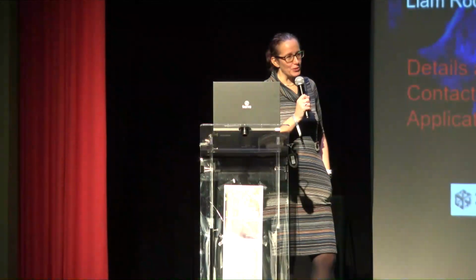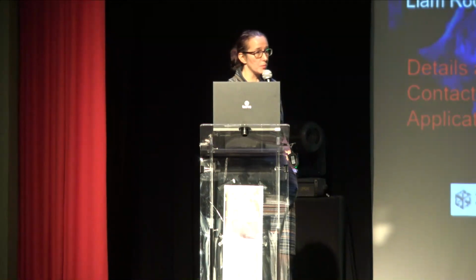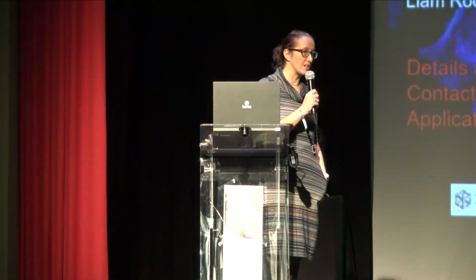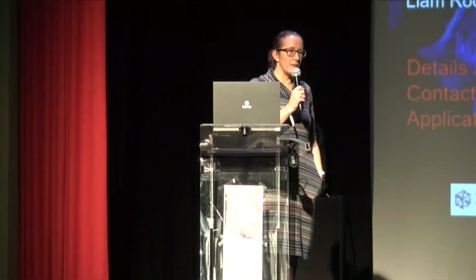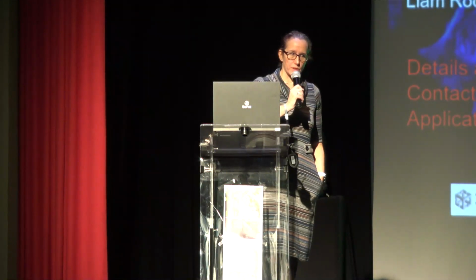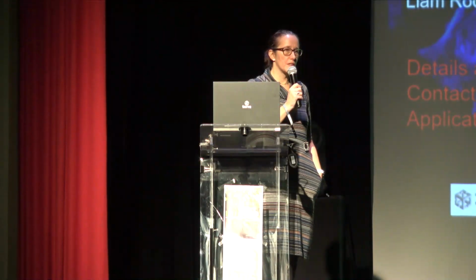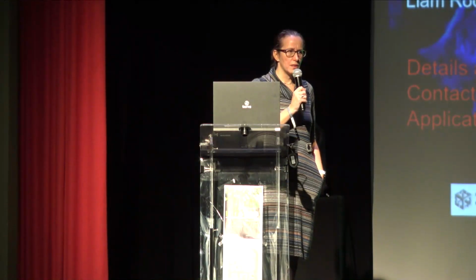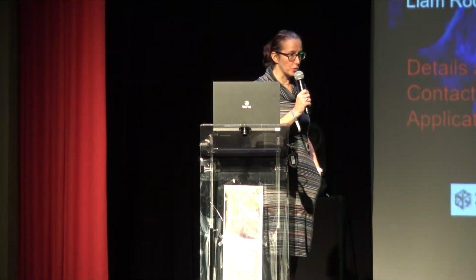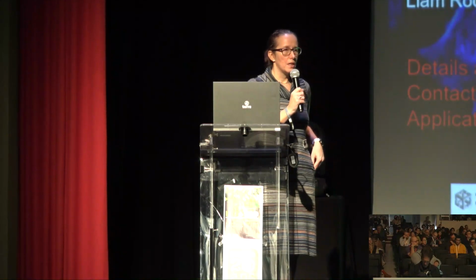So I agree with you. I had expected that the bleaching would behave probably non-linearly, like the work of Patterson and Piston. What we found at the micro scale, forgetting about the Mesolens work that I've just presented, is that the bleaching also was a lot lower than we expected compared to single photons. We've already published this in 2016, so we can chat about that one later.